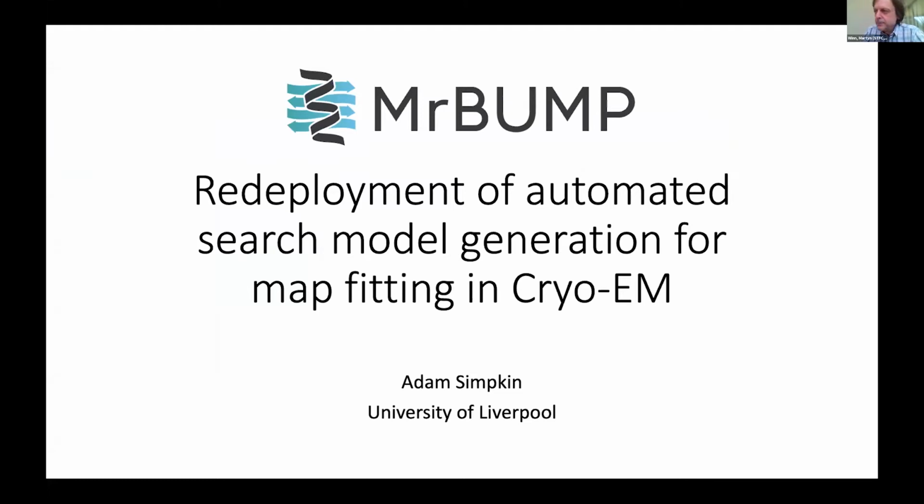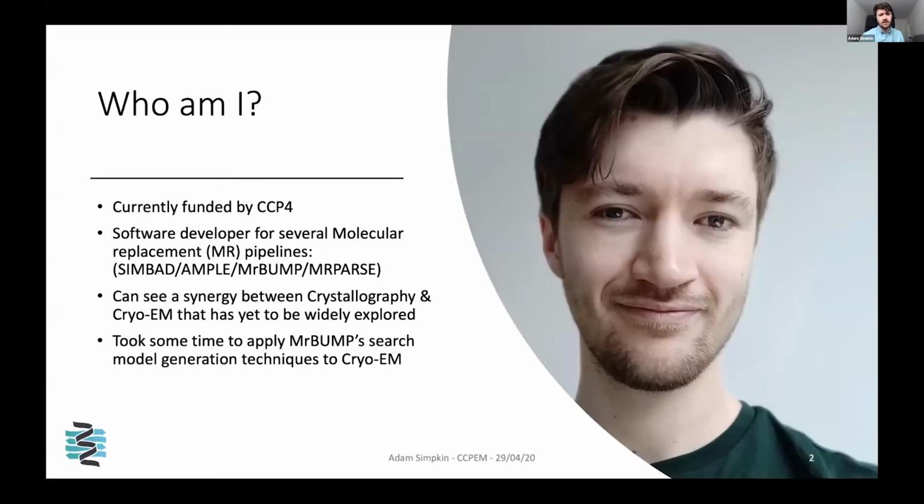Okay, thank you, Adam. Thank you for that introduction. I'd also like to thank the organisers for inviting me to talk today. I'm going to be talking about MrBUMP and specifically the redeployment of automated search model generation for map fitting in cryo-EM. So I'm going to start with a slide titled Who Am I?